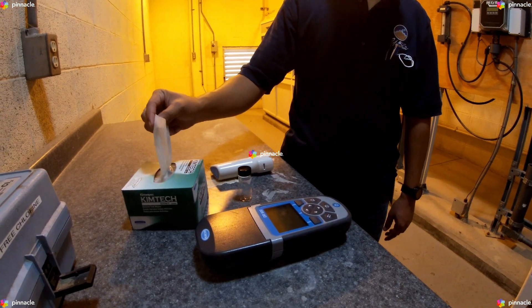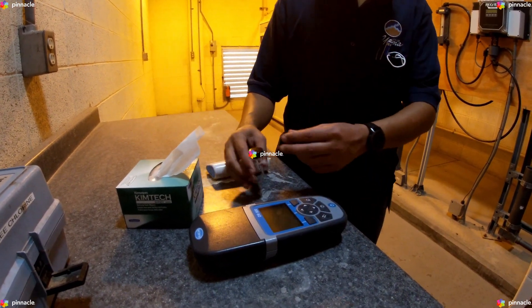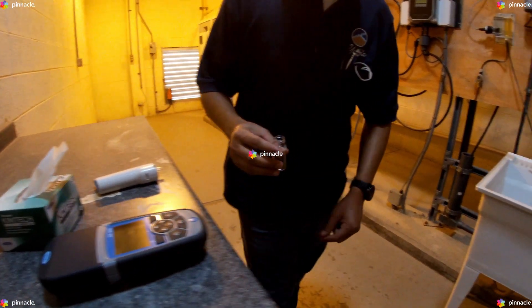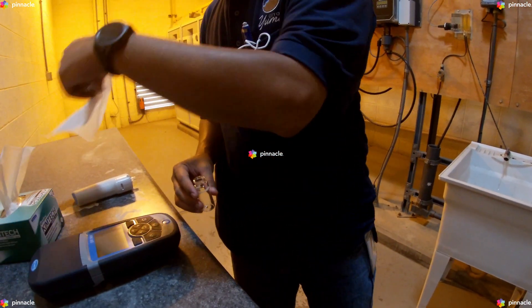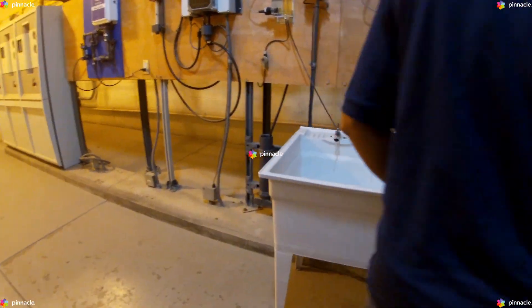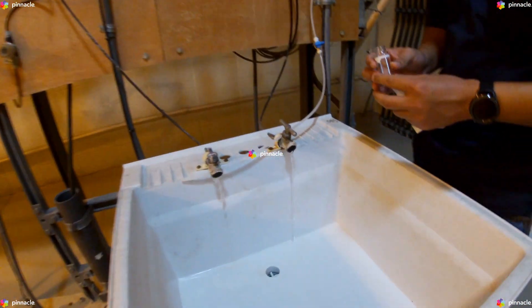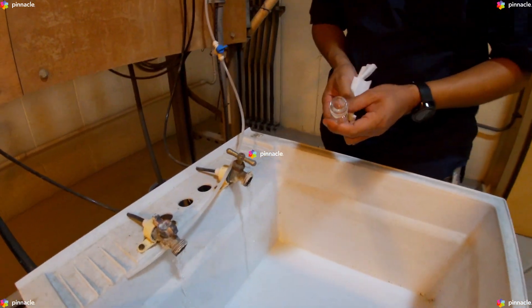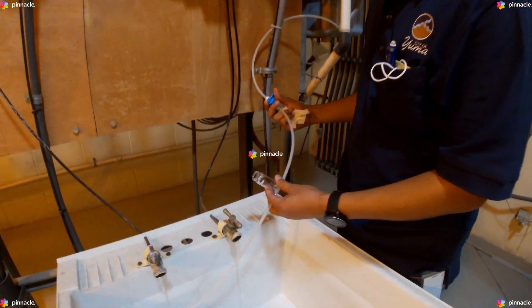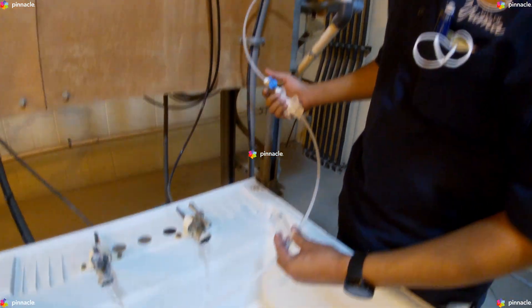We will begin our verification procedure by grabbing our glass sample cell and first flushing our sample line.